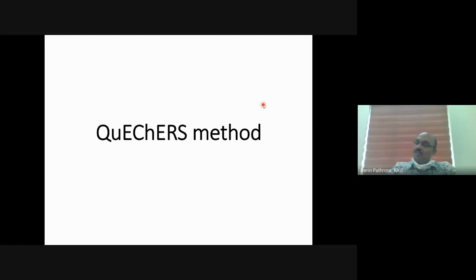Once QuEChERS was invented, it revolutionized pesticide residue analysis. It became extremely quick, easy, cheap, effective, and safe compared to these. Though we still employ some of these methods, QuEChERS is employed for say 70 to 80 percent of the samples all over the world.